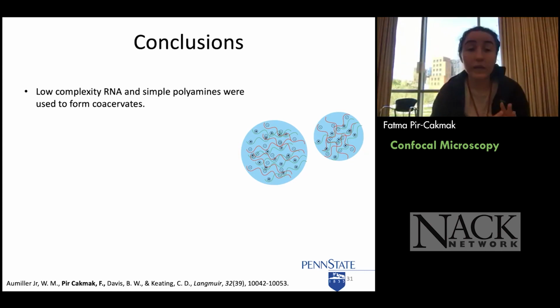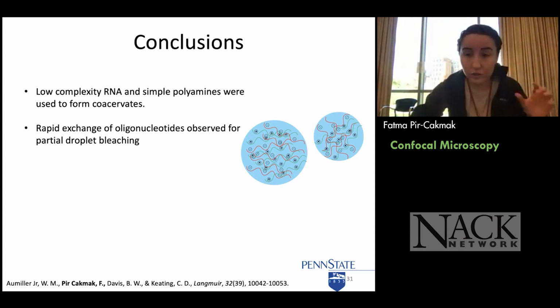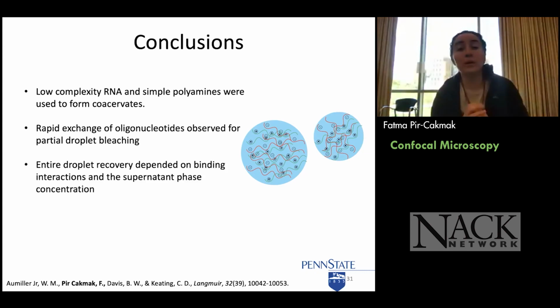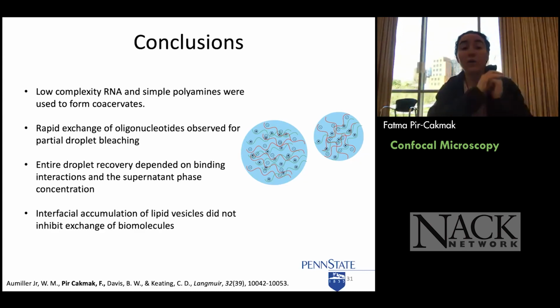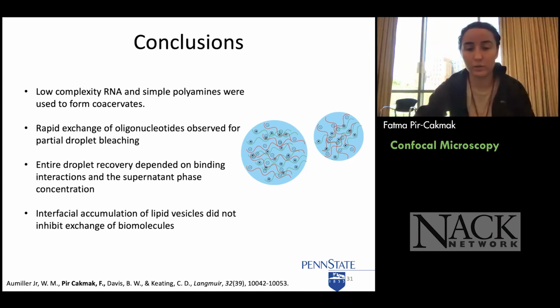So with that, I showed you that I can form compartment mimics to study cell compartmentalization in vitro. I showed rapid exchange of oligonucleotides observed for partial droplet bleaching, but for entire droplet recovery dependent on binding interactions and supernatant phase concentration. And just accumulating lipid vesicles around the coacervates did not result in inhibition of diffusion of biomolecules.